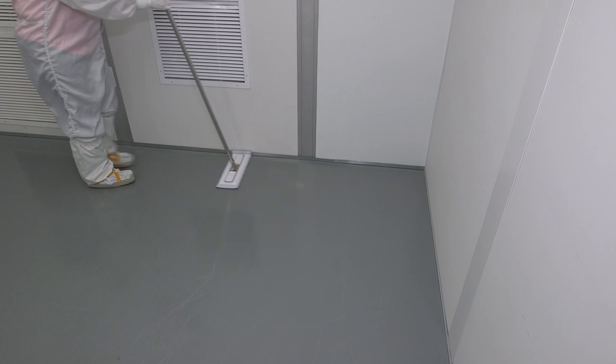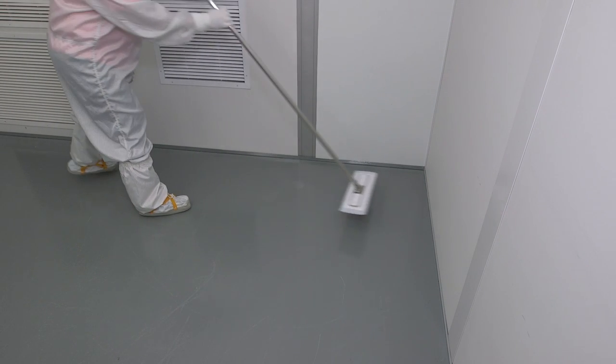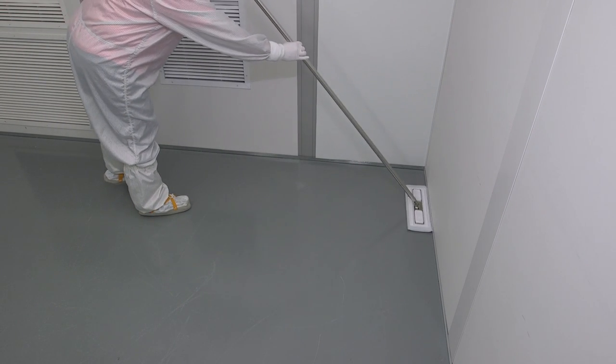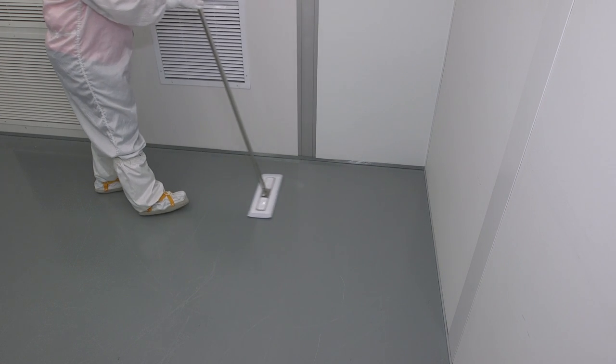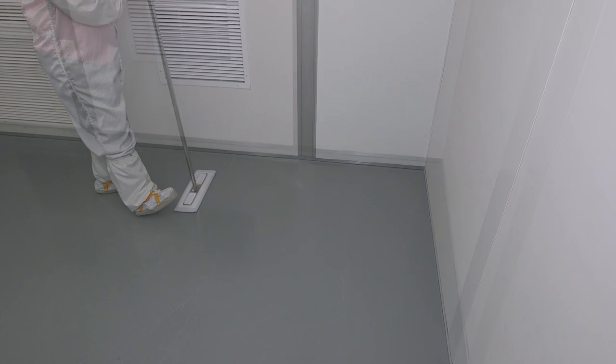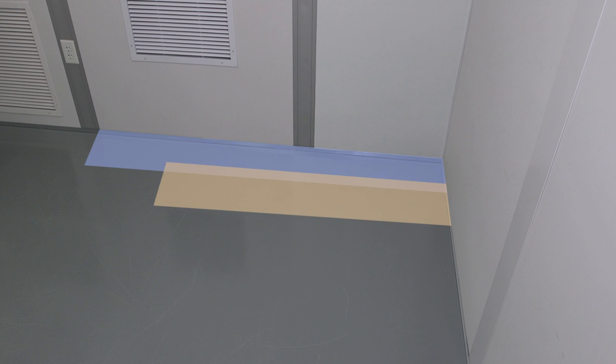To clean and disinfect cleanroom floors, use a single-use mop with a prepared cleaner. Start at the corner of the room furthest from the entryway, moving the damp mop using the place and pull method and overlapping strokes.